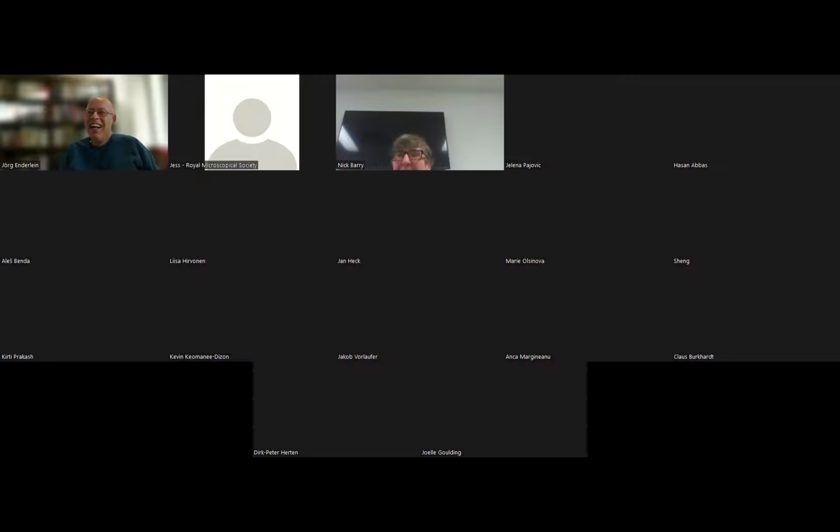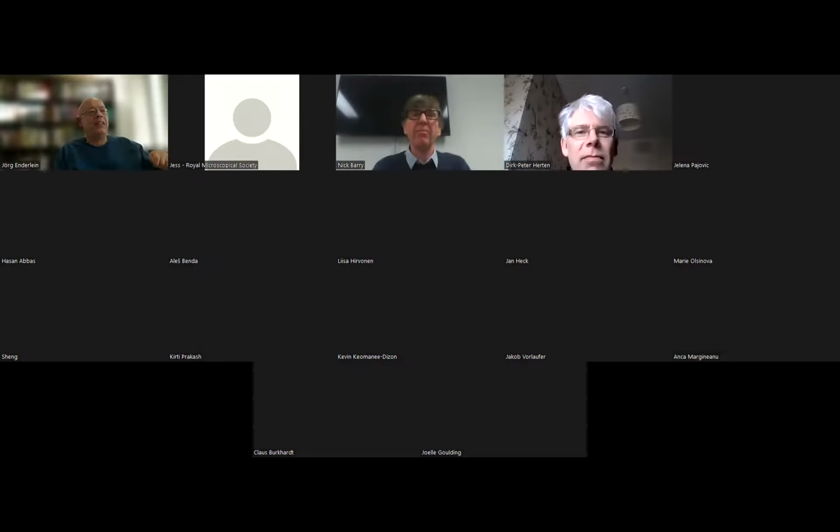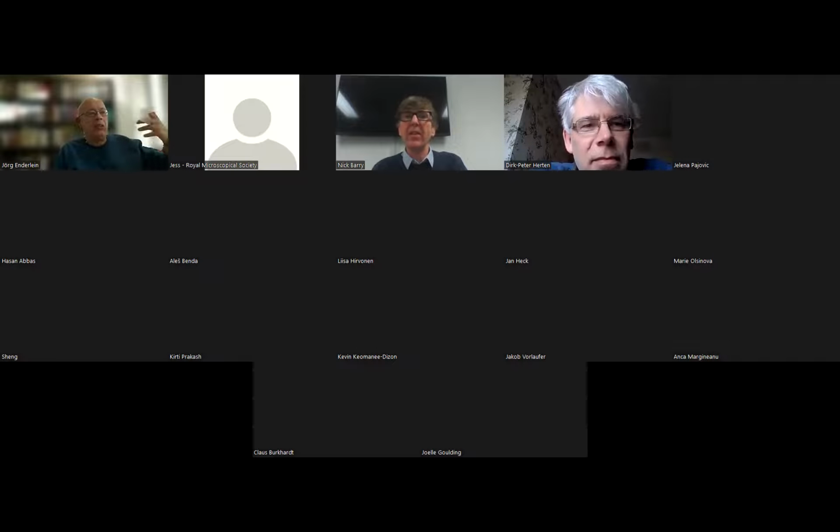Okay, so back to the questions. There was one very nice question from Bilayer. When we approach angstrom resolution along the z-axis, does the flexibility of the linker with which the dye is linked to the bilayer not then come into play?